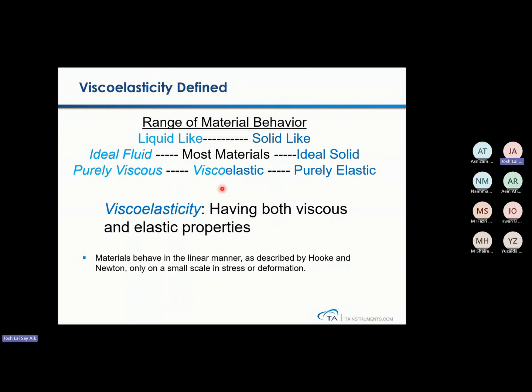So, range of material behavior. What you are measuring actually is a viscoelastic material, which is always in the middle, depending on what temperature you are measuring, depending on what frequency you are measuring, or depending on what amplitude you are measuring.